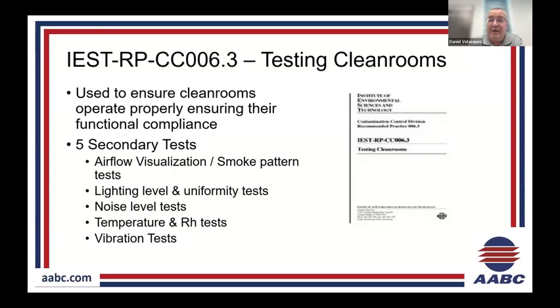Lighting level and uniformity. It's an ergonomic test that a lot of sites do request. Noise level testing. There are upper limits for noise level exposure for their workers. Temperature and RH get very critical. Number one's for ergonomics. If you're gowned up in a clean room gown and you're slightly overweight like myself, you get hot as you're moving around. So they want to make sure that the space isn't too hot, it's not too warm. Their workers won't overheat.